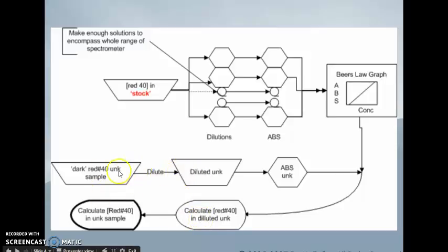When we did the dilution, we knew how much of the soda sample we used and how much we diluted it to, so we know V sub stock, V sub S, if you will, and we know V sub D for volume of the diluted. And now we know the concentration of the diluted. So we know V_S, we know V_D, and we know the concentration of the diluted, allowing us to calculate the concentration of, in this case, the stock soda sample, the undiluted soda sample.